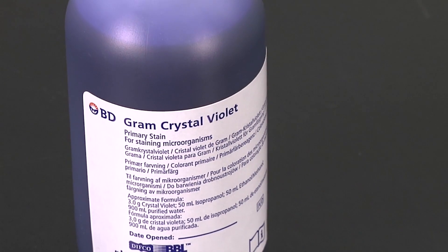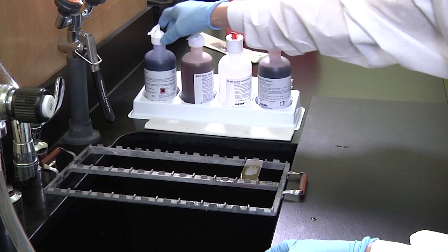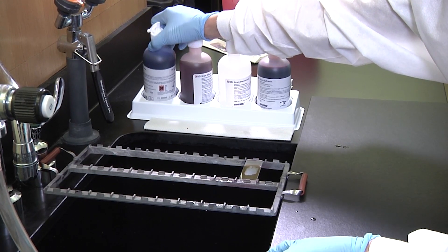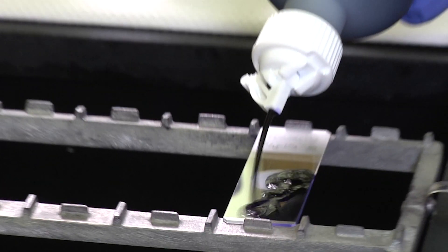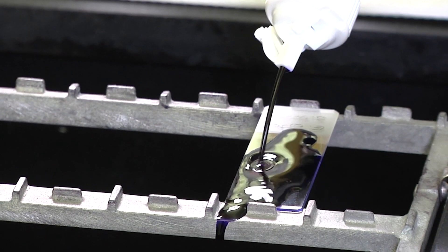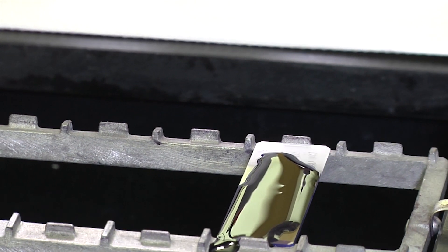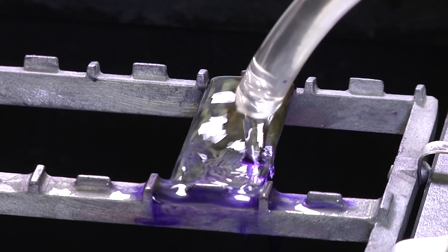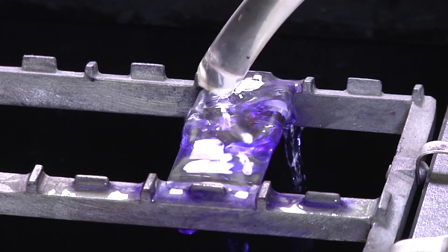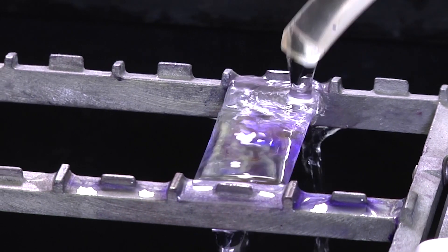The first reagent to use is the crystal violet, which is an alkaline dye. Slowly pour the crystal violet reagent over the slide in an even manner. During this step, the dye crystal violet is binding to the cell wall of the bacteria. The smear will be a purple color. Immediately after pouring the crystal violet over the slide, set the timer for 15 seconds. After the time is up, using the hose attached to the faucet, gently rinse the slide with a steady stream of water to remove any excess crystal violet.